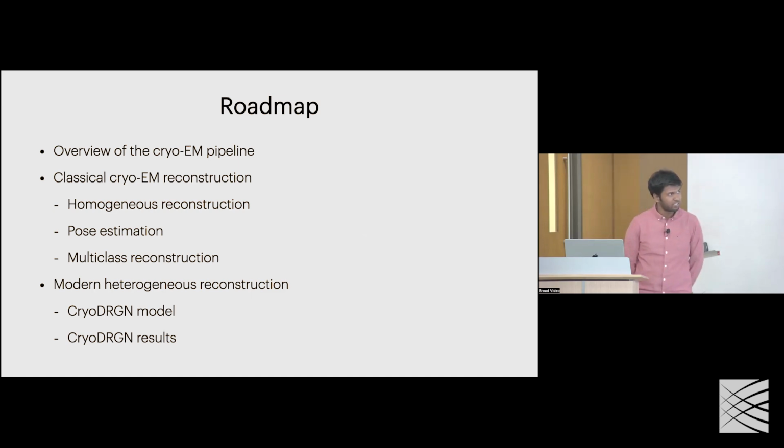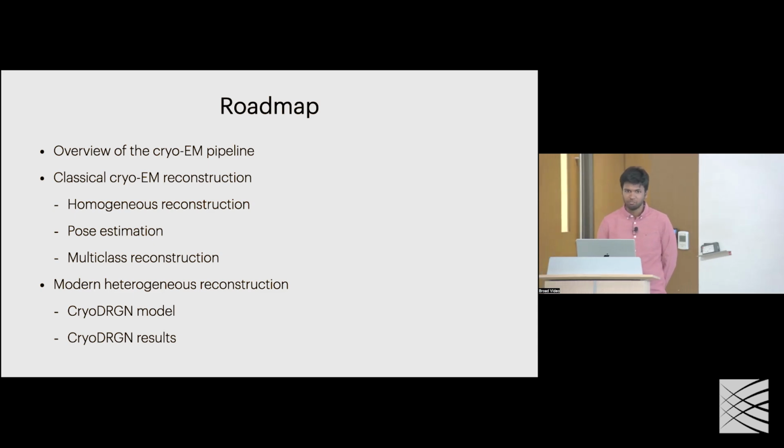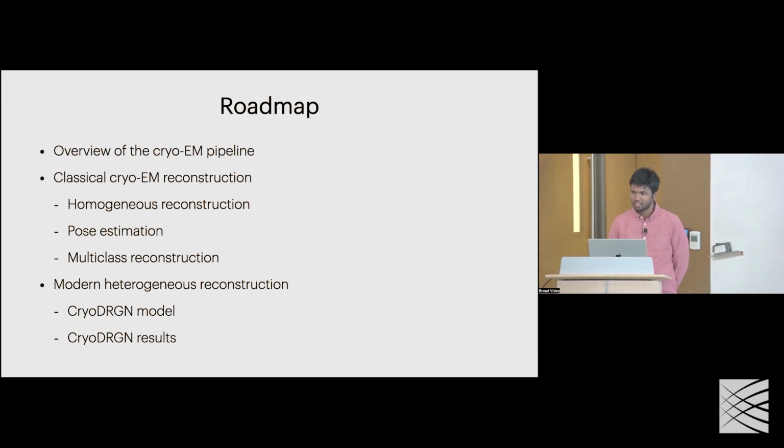And then I'll spend some time talking about the classical algorithms for cryo-EM reconstruction, just to get the underlying theory. And then that'll set up the final part of my talk on modern methods for heterogeneous reconstruction. And then finally leading into Ellen's talk, giving some broader context for these methods and some of the newer developments within our lab tackling these challenges.